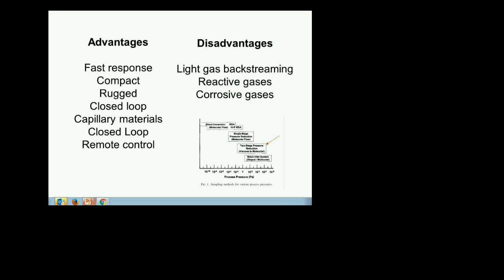We are going to use RGA to characterize the parts before we can ship them to our customer, so they're clean. Basically, all I need to do is measure organic compounds and water. Before that, I hook up the RGA to the furnace in which I bake the parts. I bake the parts in hydrogen, then I close the hydrogen, pump down to vacuum, open the valve, turn on the RGA and measure, right? Yes.